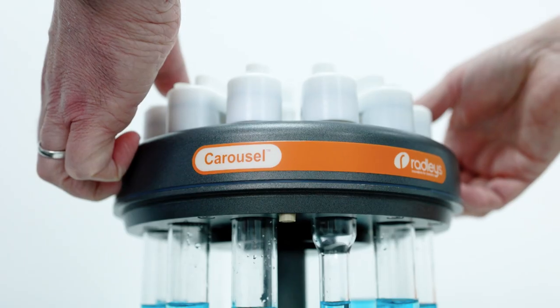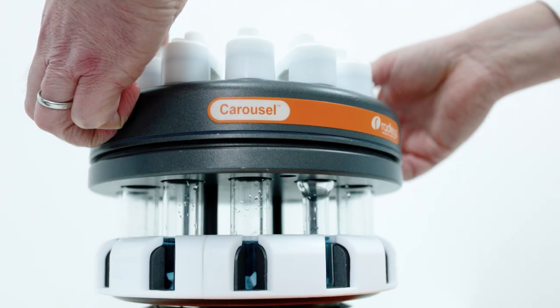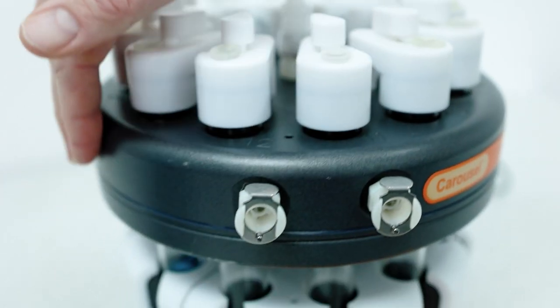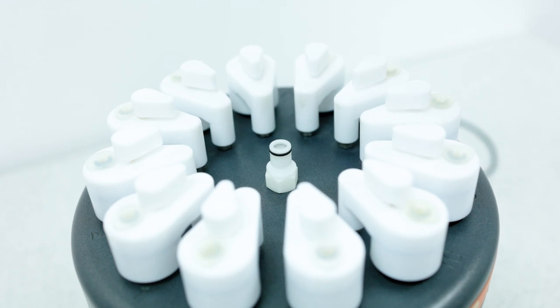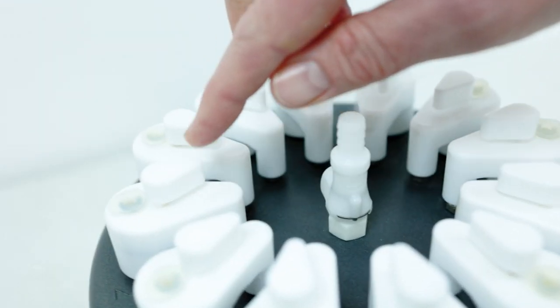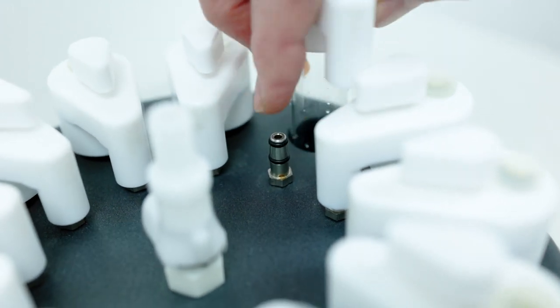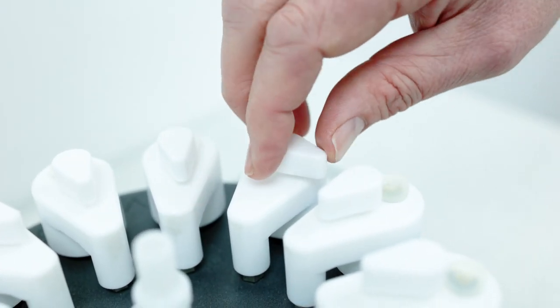We can then locate the Carousel reflux head with the tubes onto the base via the locating pin. The reflux head has three quick connections: one for water in and water out, which circulates cooling water evenly, negating the need for a standard reflux condenser. We then have a third quick connect which distributes inert gas to each of the positions, sealed by the two O-rings. The shut-off valve on the EZON cap enables you to regulate that flow.